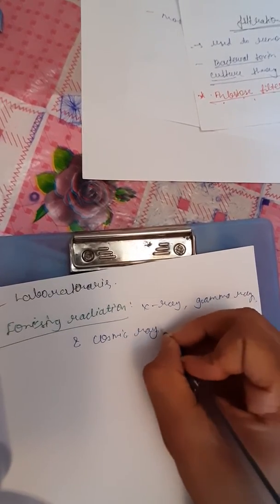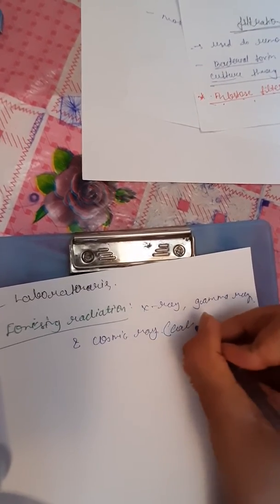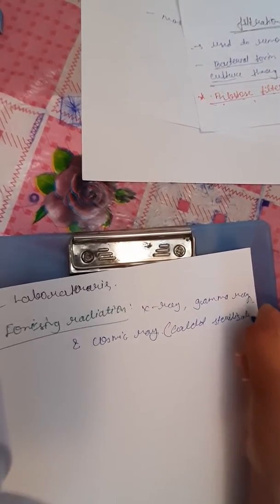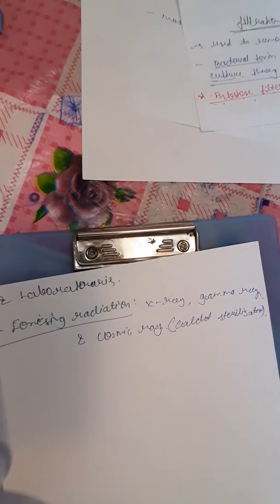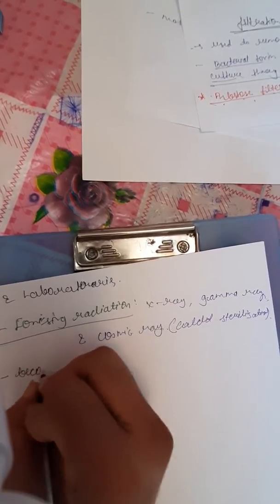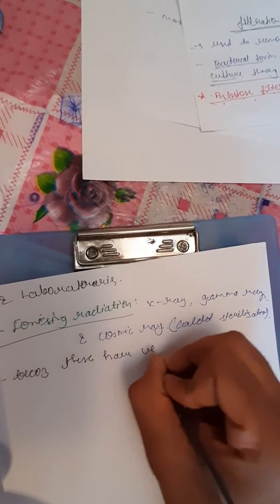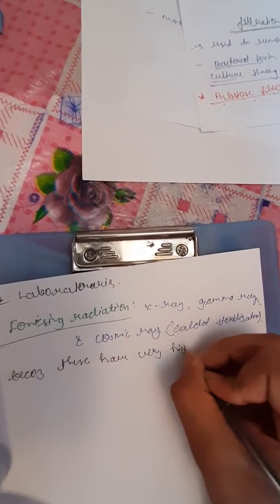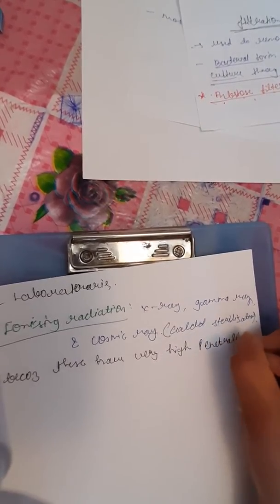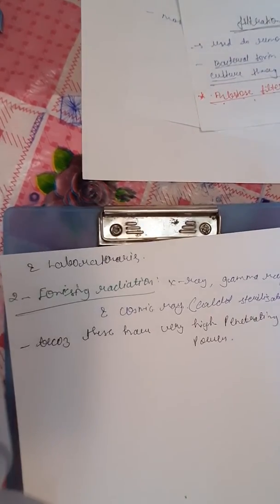As before, all these are also used for cold sterilization, because these have very high penetrating power. And we will see where we use them.